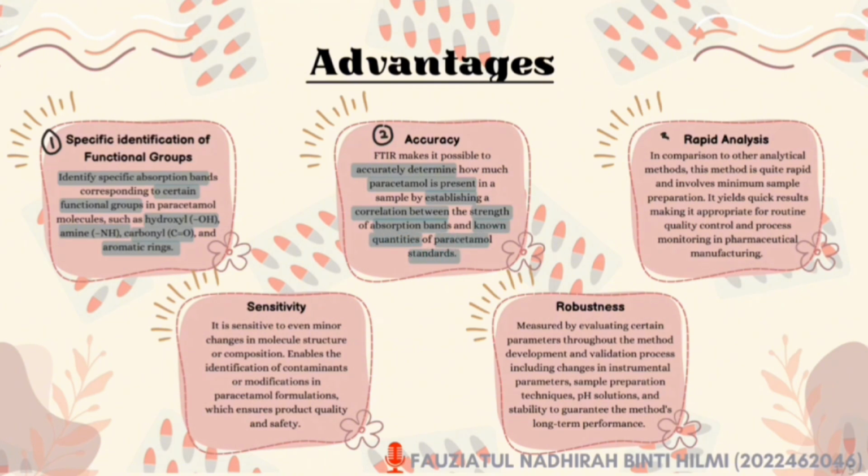The third one is rapid analysis. This method is quite rapid and involves minimum sample preparation compared to other analytical methods, which means it yields quick results, making it appropriate for routine quality control and process monitoring in pharmaceutical manufacturing.